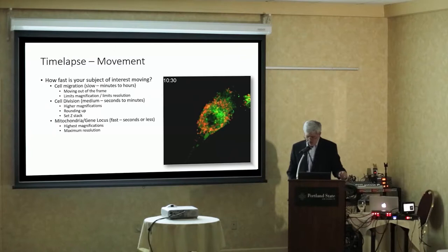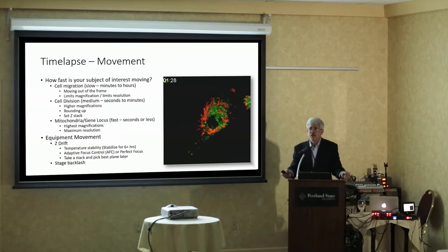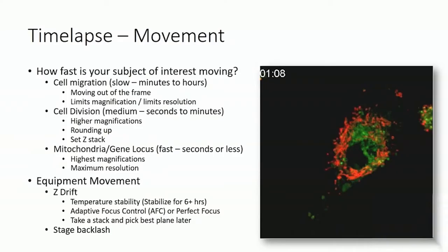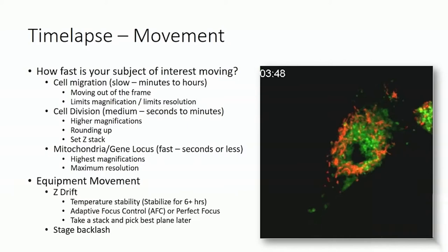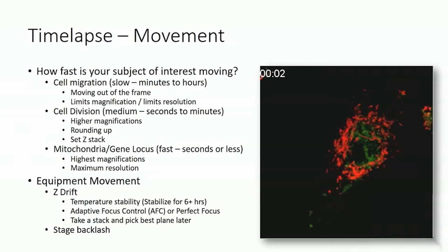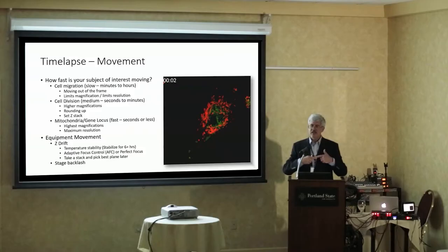Just as with cameras, the subject can be moving, but your equipment can be moving too and screwing things up. One major issue is Z-drift — the stage is actually settling down and your cells go out of focus while you're trying to image. It usually isn't a problem in 15 minutes, but it can be a problem over days. Stage backlash is another issue: as you're doing multipoint movement, going clockwise gives one effect and counterclockwise gives a different effect because of the screws in the stage, leading to jiggling in your final images.